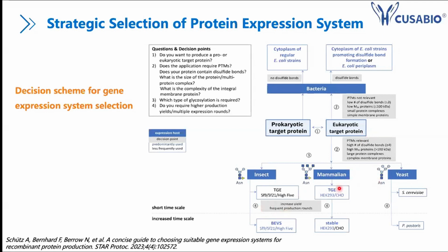Then, based on your project, like the amount of protein yield and the cycle of your project, you can choose among these 3 expression systems. If your protein requires complex modification, then it's highly recommended to use mammalian cells. If your project requires a very high protein yield, then the other expression system may be a good choice. So be smart when you choose the protein expression system. I think if you do this, you will avoid a lot of future problems in the project.